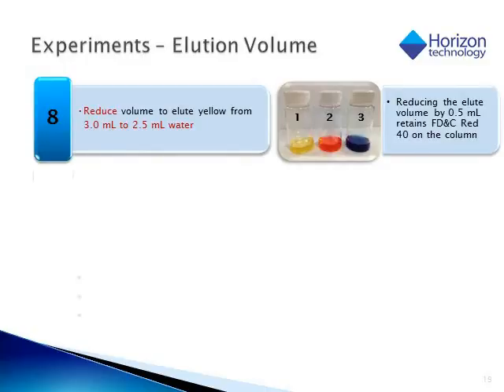So with the elution being on the agenda here as an important area to focus on, we wanted to be able to elute the smallest volume possible, and optimization really plays a key role in determining where the elution volume would sit for the volume used versus the recommended volume from the cartridge manufacturer. So one of the thoughts as to why I might be getting some red in my yellow tube number 1 here would be that I'm just eluting with too much volume.